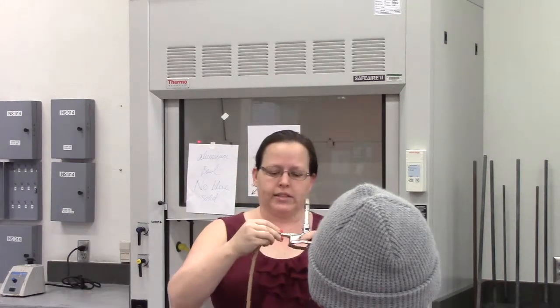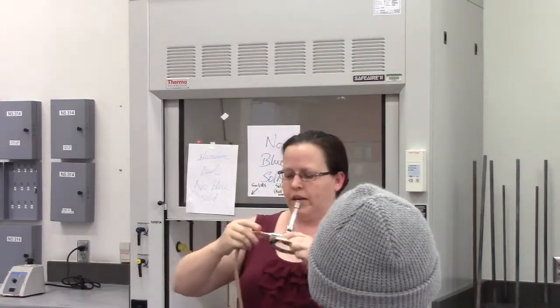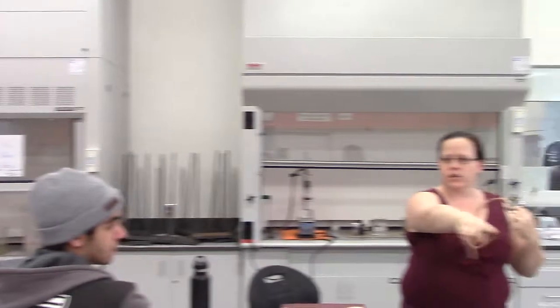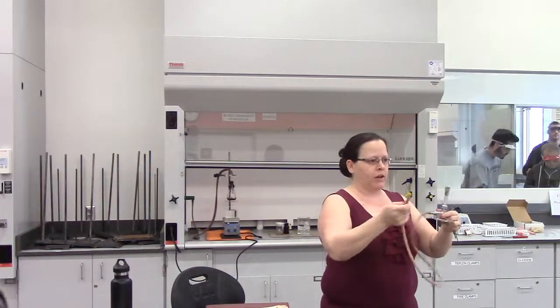It doesn't look like it's going to fit, but it's really soft. It'll go on there. And then the other end of the tubing goes on the gas lines that are in the middle of the table. Okay? The gas lines are the ones that are blue. So again, just shove it onto the end.